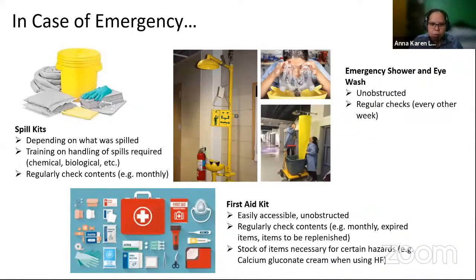And so if you're working with HF, of course you have to have the proper training when working with HF, and also to have this particular cream in your first aid kit.